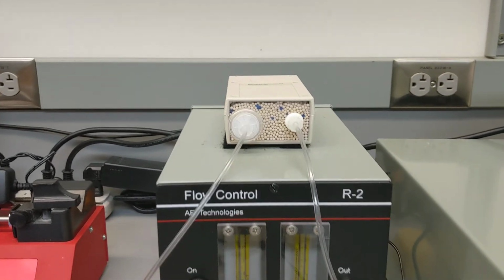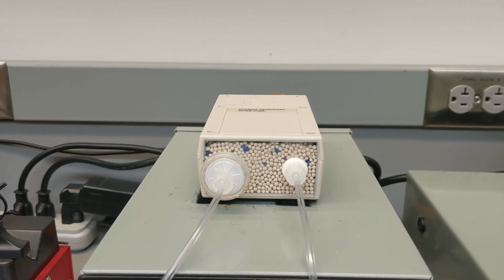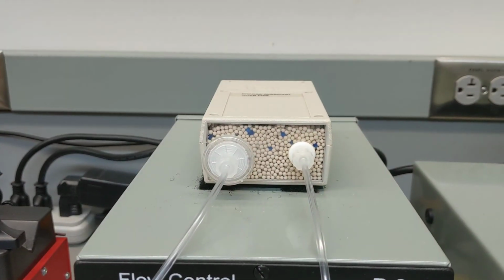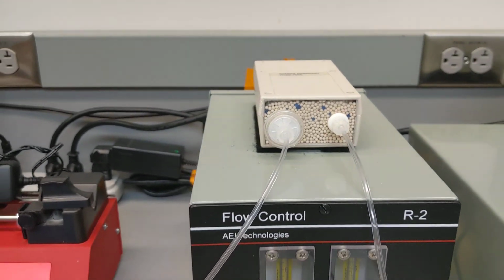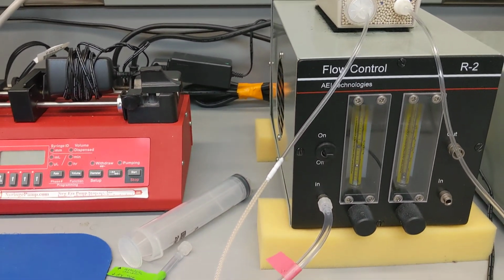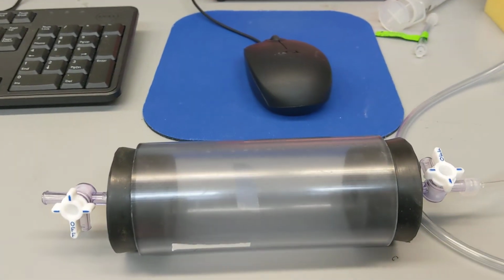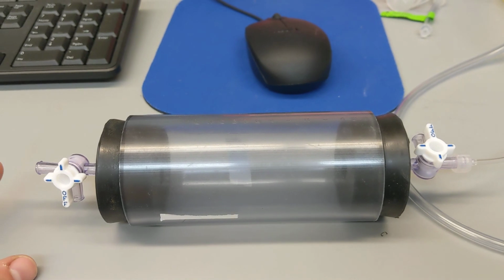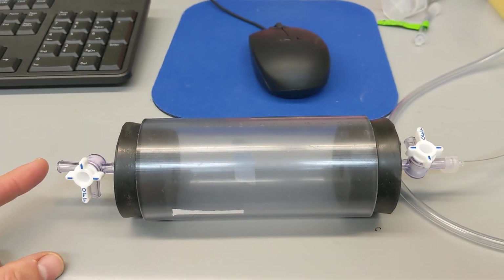Well, our next step right here is this thing called a dryer box, which is on top of the air pump. This takes all the water vapor out of the particular air sample. So it's coming this way, right? So we're coming in this way, going this way. We'll follow this small tubing all the way down. And here you could see the metabolic chamber. So starting on the opposite end of it, here's the free open end of the metabolic chamber right here. This is where the air is actually being pulled from.